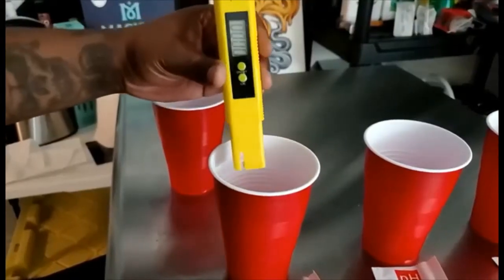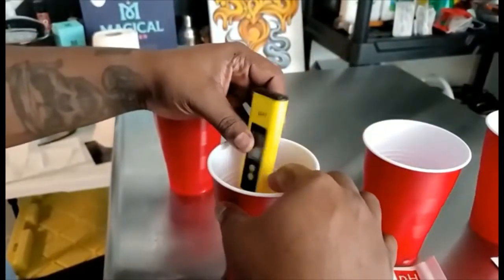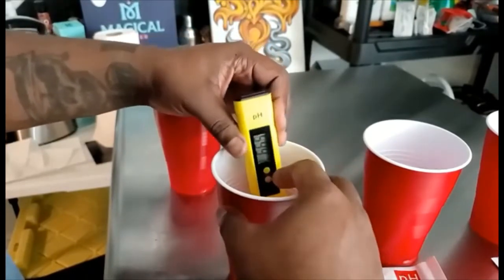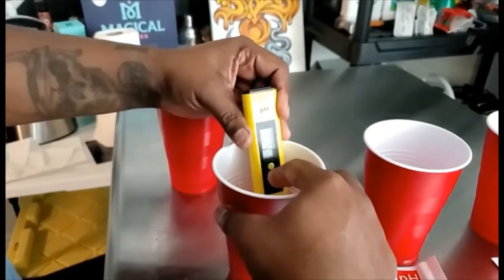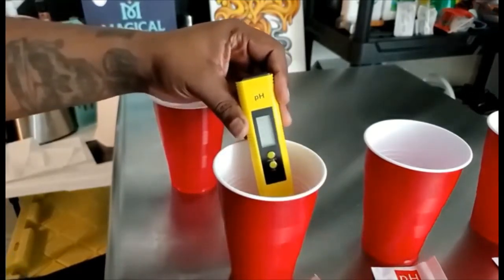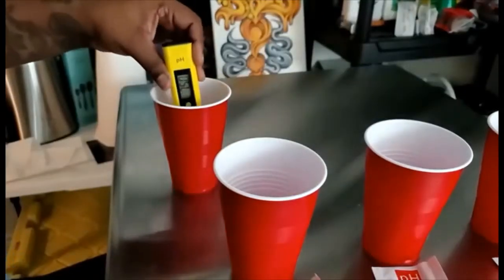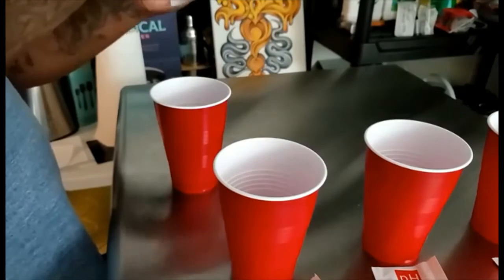To calibrate your pH tester, take the tester and put it inside the 6.86 solution first. Make sure it's turned on. Hold down the calibrate button for five seconds, then release it — it's going to flash three times and show you 6.86, just like it's on the packet. After that, clean the electrode with distilled water and dry it.